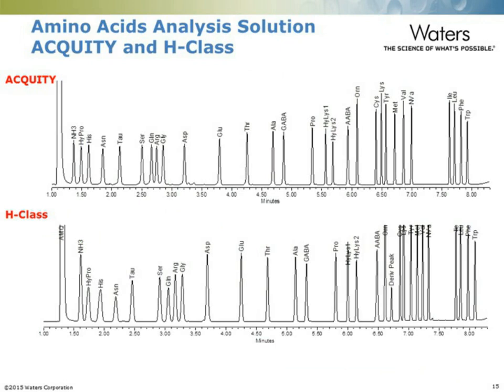The separation on the two instruments is virtually identical. There is a shift in retention of a few tenths of a minute in the later part of the chromatogram. We constrained ourselves in the development so that we would use the same chemistry on both instruments and adjust the method so that we could get the same analytical quality.